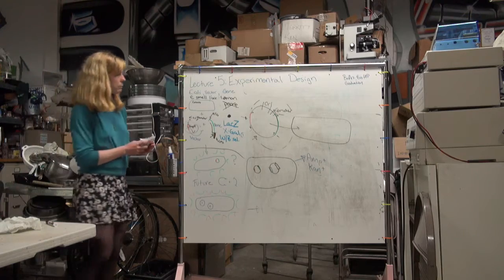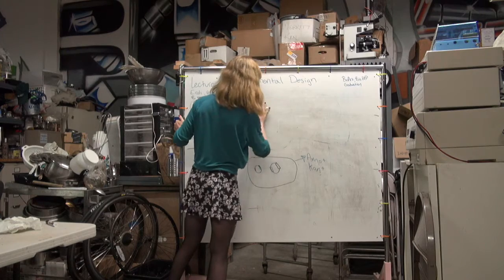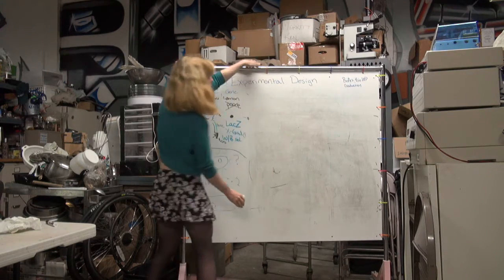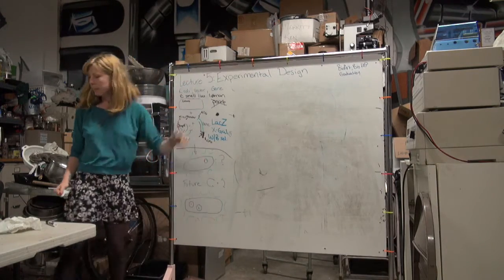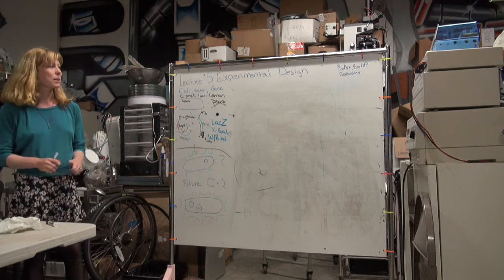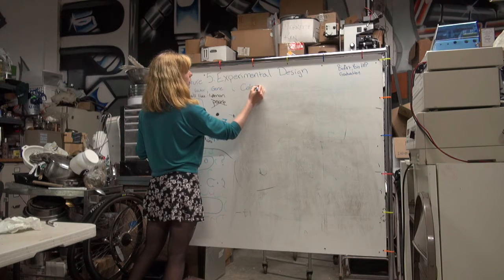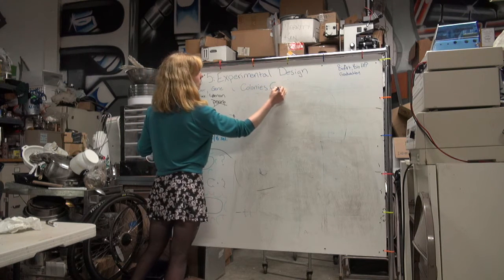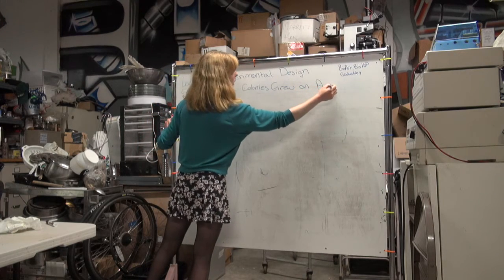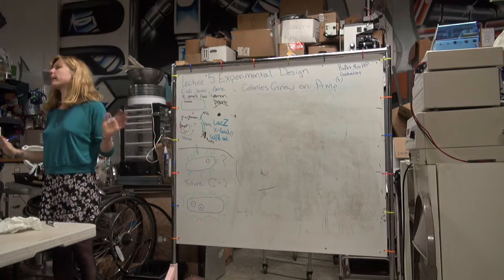All right, so cool. So just because we saw colonies grow, it doesn't mean that we actually got what we wanted, right? So the first step, so yay, colonies grew on AMP plus, and all of our other false positives, fine, it's cleared out.